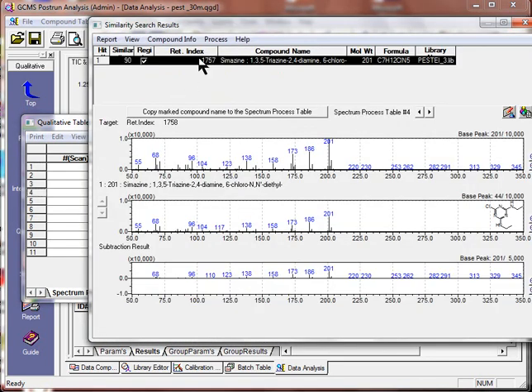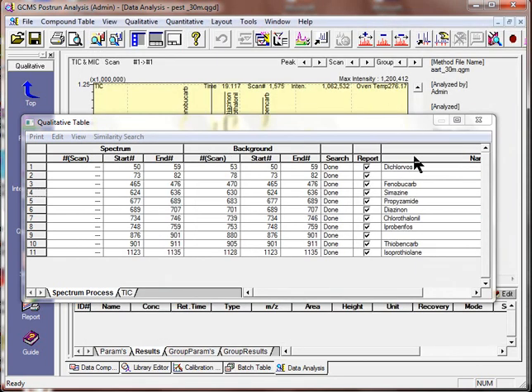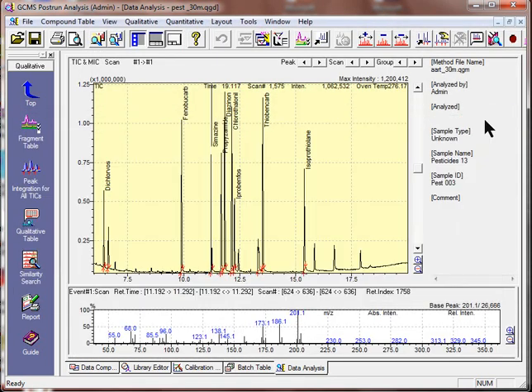Here the calculated retention index of that peak is 1758, and the library says 1757, so very precise. This is a good example, while very often Shimadzu libraries are more precise when using linear retention index, because commercial libraries like NIST have lots of entries and the experimental conditions are not always clear.